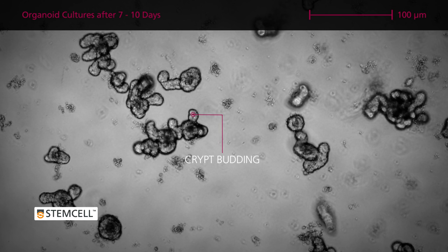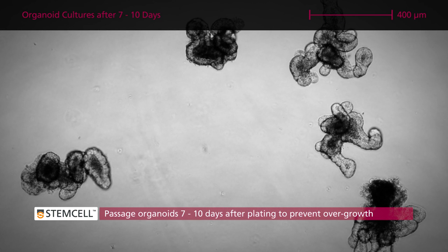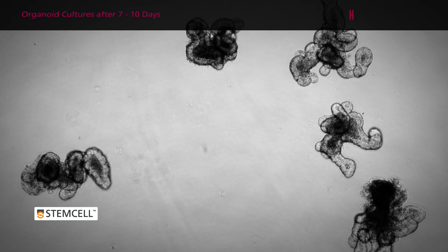Organoids will expand and exhibit crypt budding over the five to seven days following plating. Organoids should be passaged between seven and ten days post-plating to prevent overgrowth and excessive accumulation of debris within the lumen. For a detailed protocol for passaging intestinal organoids, watch the video Mouse Intestinal Organoid Passaging.